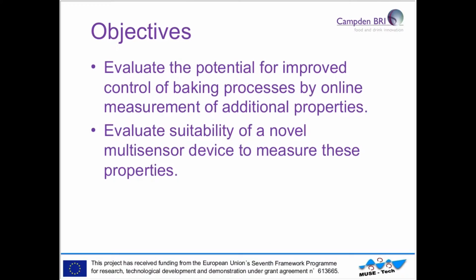So our objectives are to identify what the potential is for improving control of baking processes through measuring some additional properties that aren't currently measured, and to assess whether the particular device built in MUSE-Tech is capable of making those measurements.